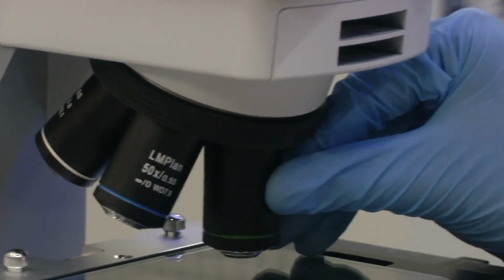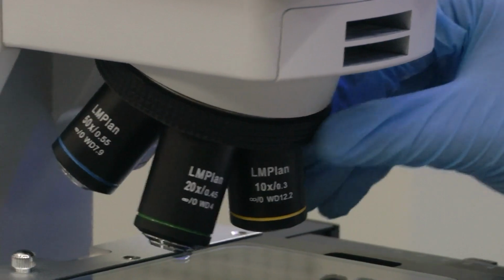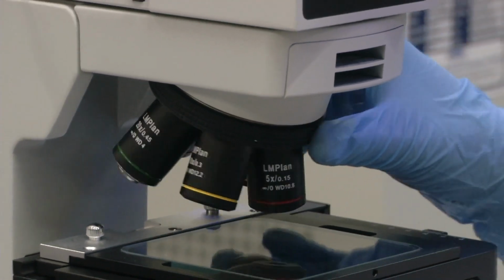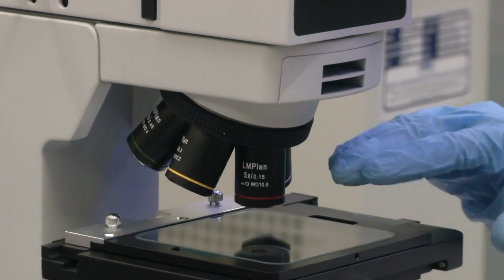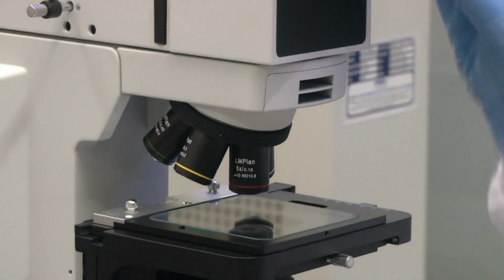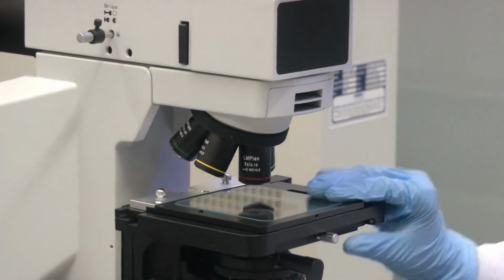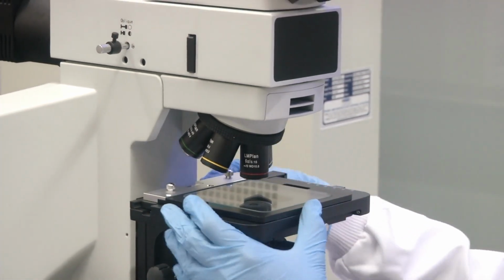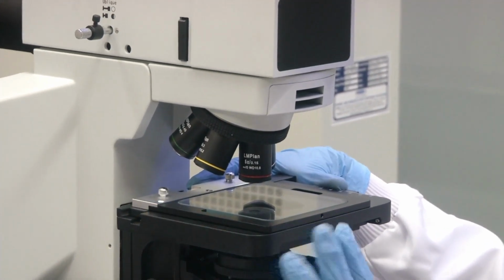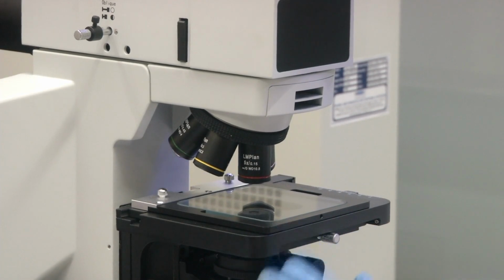So, once we decide what magnification we need, we will keep the objective lens at that magnification, insert our sample on the sample holder, and then look at it through the eyepiece. Now, the sample holder, I think you can see the sample holder. You had seen the stereo microscope before. Compared to the stereo microscope, this sample holder is a much more complex piece of equipment.